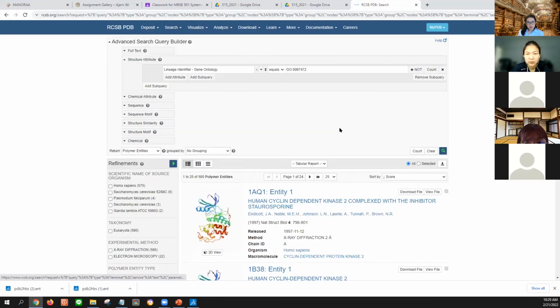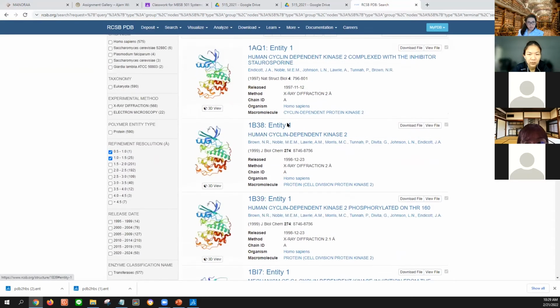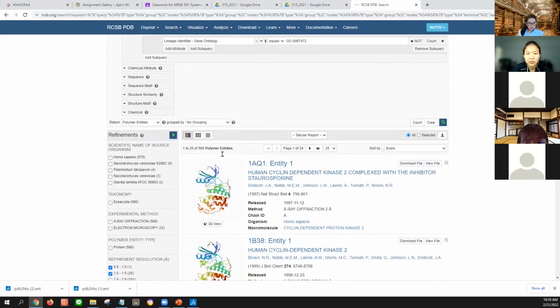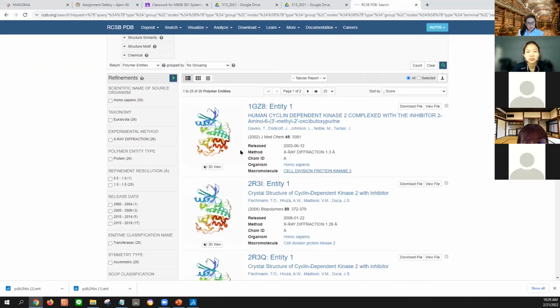Now, I will show you how to do ligand interactions. Let's say, click play here. So this means 0.5 to 1 to 1.5.